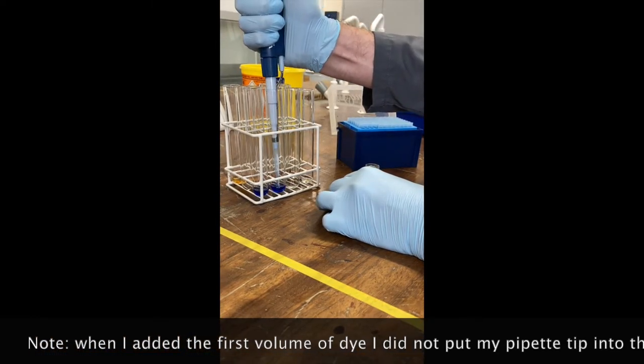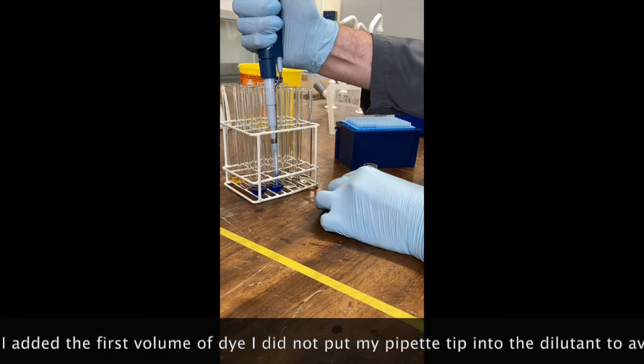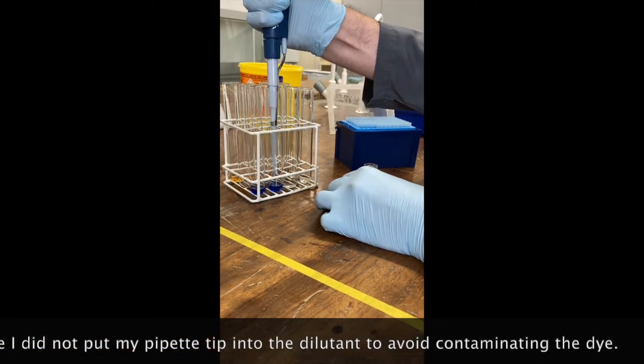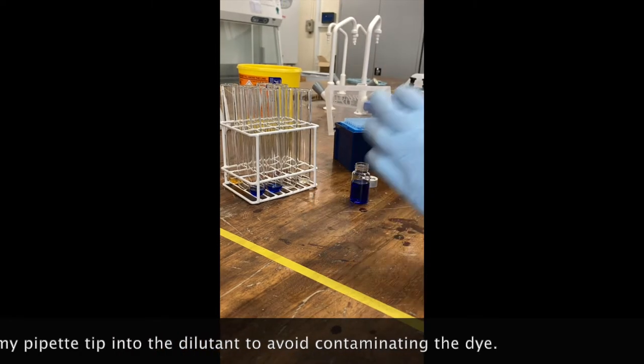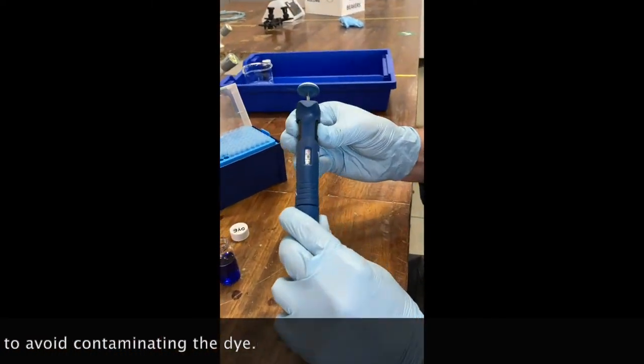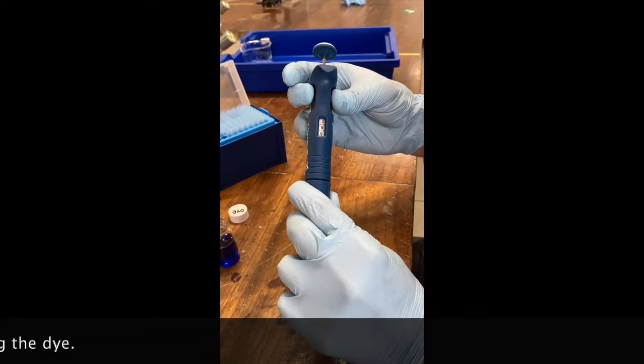And then what you want to do is you just want to make sure you pipette up and down a few times, gently, just to make sure you properly mix your solution. For the second tube, I'm going to have one mil of water. So I'm going to need to put one mil of my standard solution in.